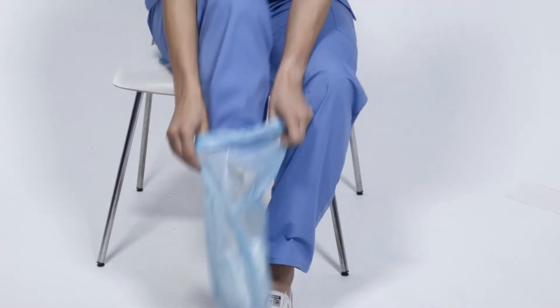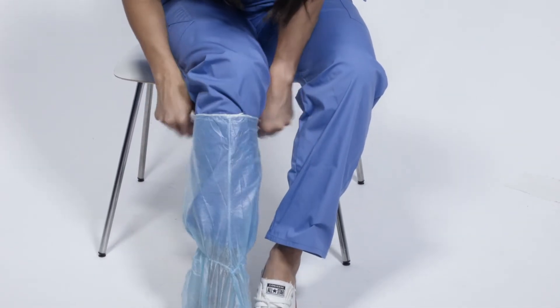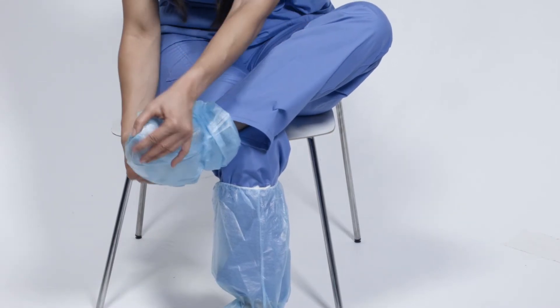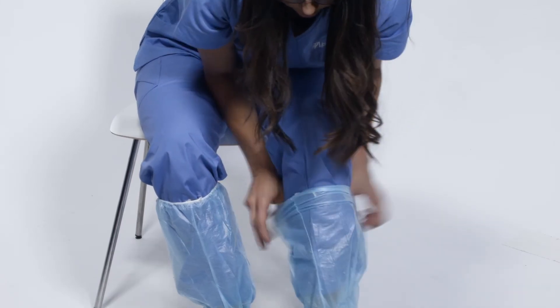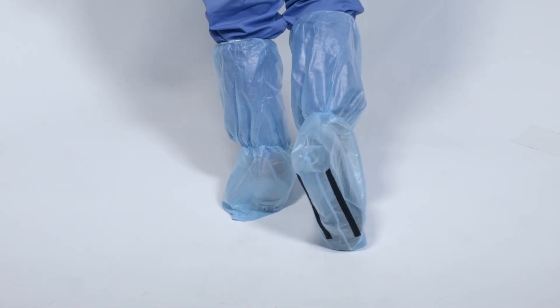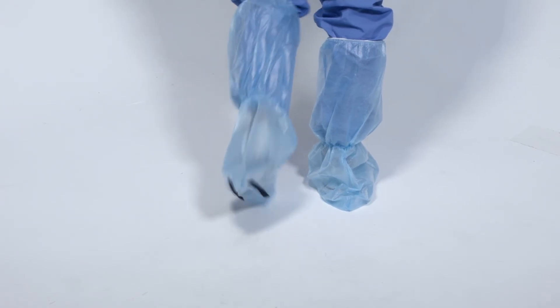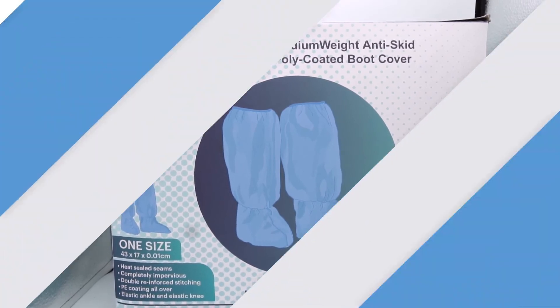Insert the feet tip first through the feet hole, place the elastic strap around the bottom of the boot first and adjust the ankle elastic strap to wrap around the bottom of the boot in a snug-like manner. Next, adjust the knee-high elastic around your shins as high as possible. The medium-weight anti-skid poly-coated boot cover is your best budget-friendly choice of medical boot covers for medium to high-risk scenarios in the market.